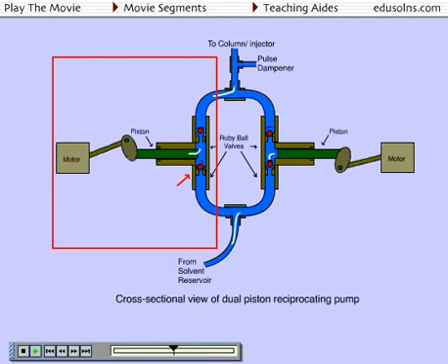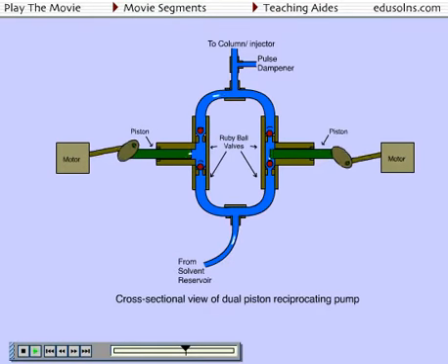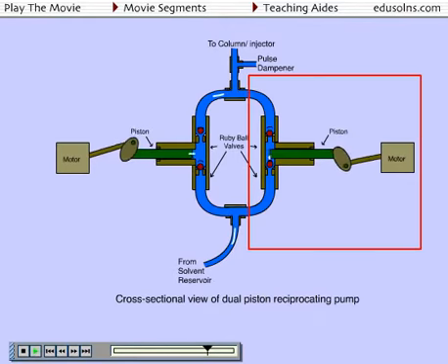Now focus on the left side of the figure. As the piston retracts, it pulls solvent into the pumping chamber. The inlet check valve is designed to allow solvent to pass upward in the system while the outlet check valve is closed during the filling operation. The check valves are very simple in design. The actual check mechanism is a ruby sphere that positions itself in a concave, funnel-shaped seat when it is in the closed position. Solvent flow traveling in the upward direction raises the ruby sphere and allows solvent to pass. When the pump reverses itself and draws solvent into the pump chamber, the top check valve closes and the bottom one opens.